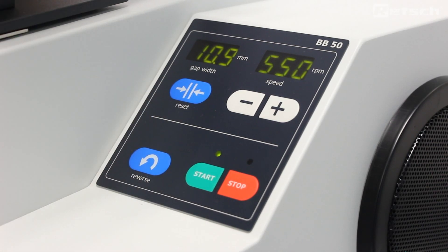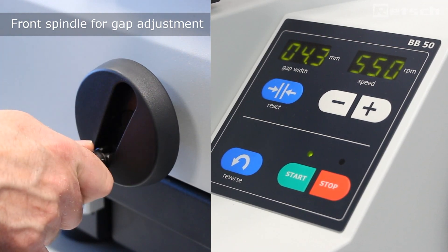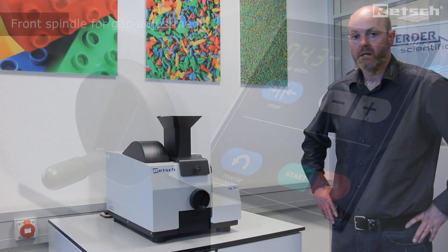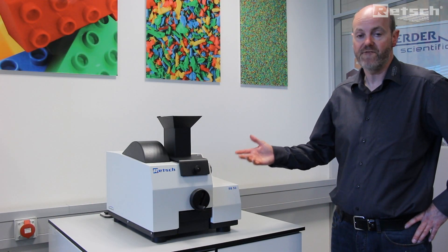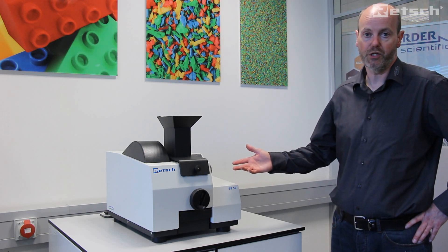Freely adjustable setting of the gap between the fixed jaw and the moving breaking jaw can simply be achieved by rotating the front spindle. The BB50 instrument is a very easy to use, effective and powerful benchtop laboratory jaw crusher.